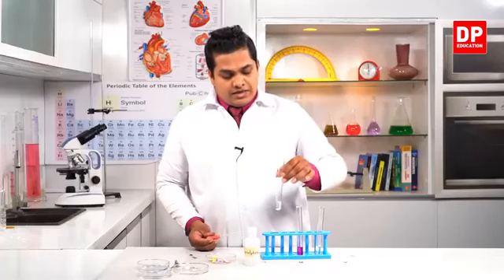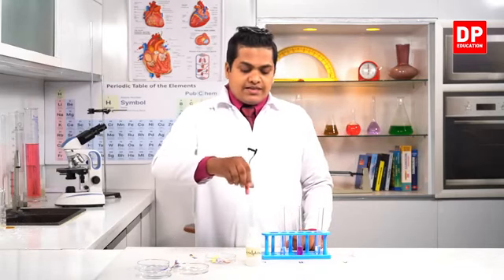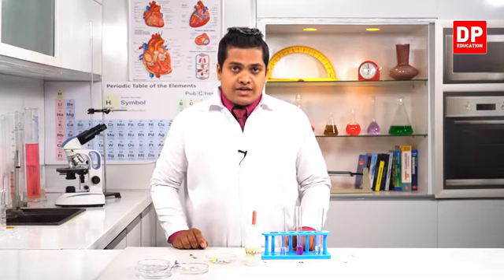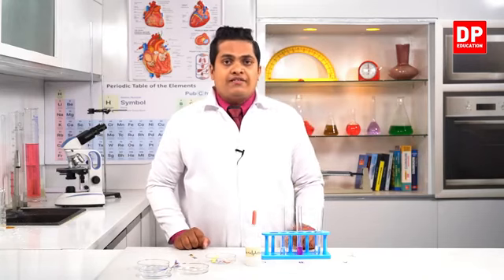So therefore, we can say that to identify bases, we can use this phenolphthalein indicator. Phenolphthalein is a substance that can turn a certain base into a pink color from the colorless solution. Sodium hydroxide is a good base. Therefore, the color of phenolphthalein is getting converted to pink. Right, my dear children, then we'll head on to the classroom and discuss further things related to the lesson.